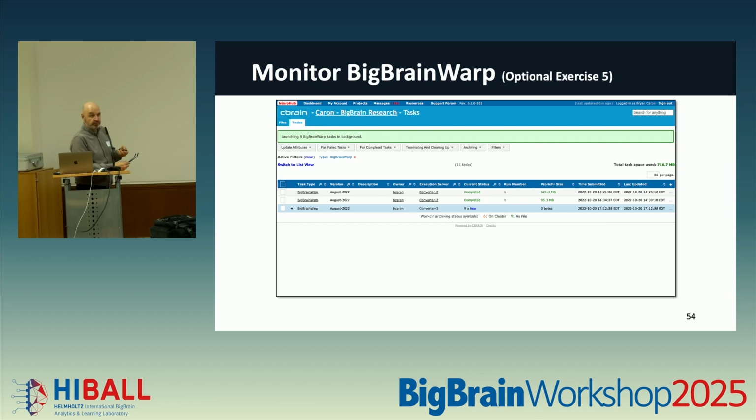And then there's a few of you here in the room. So when you refresh the page, you'll get a list. You should see the ones that you ran before as completed. And you also will see ones with a plus. The plus means you're going to have multiple concurrently running. So in my case, I have 9 new tasks in this particular view that I made. They're getting prepared to run. Okay, so let's everyone just submit the tasks and let's see where we're at.